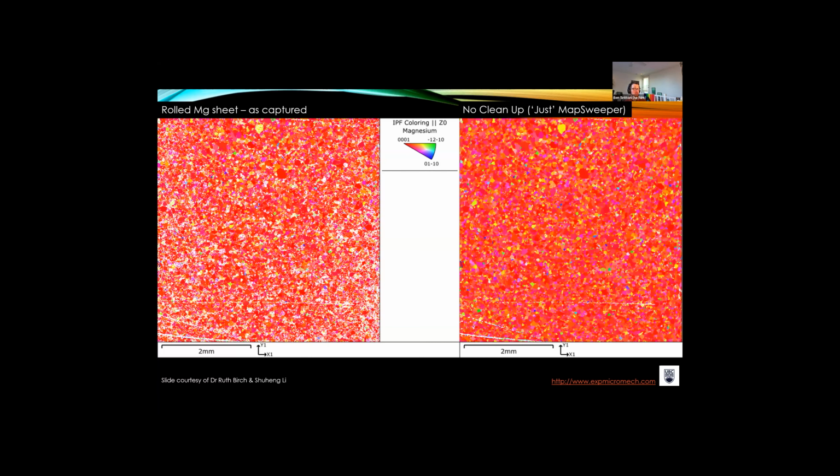And so you can cross-section the material. We have a broad ion beam polisher that's very, very useful for cross-sectioning. There you just need to worry a little bit about the conduction of what you're cutting through and where the sputter yield's going to go, and not gunking the instrument up for other people. But cross-sectioning can be very useful for dissimilar phases.